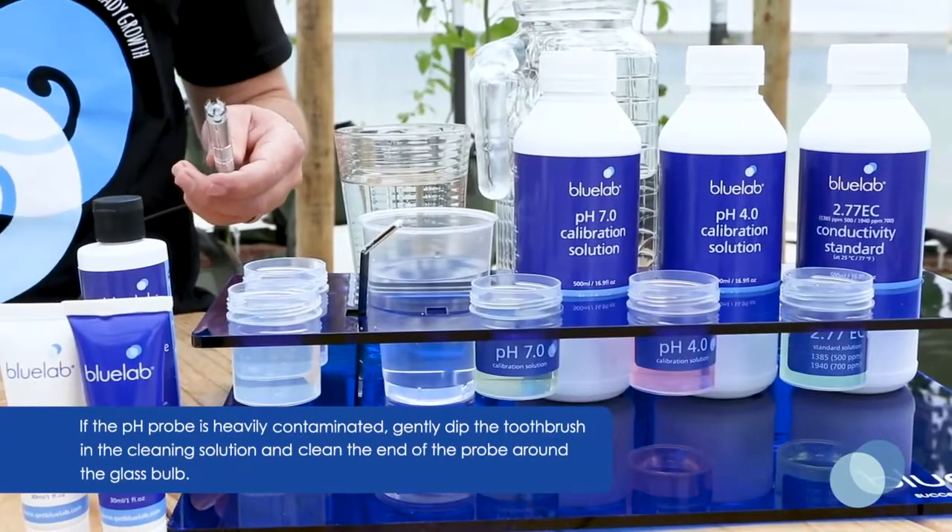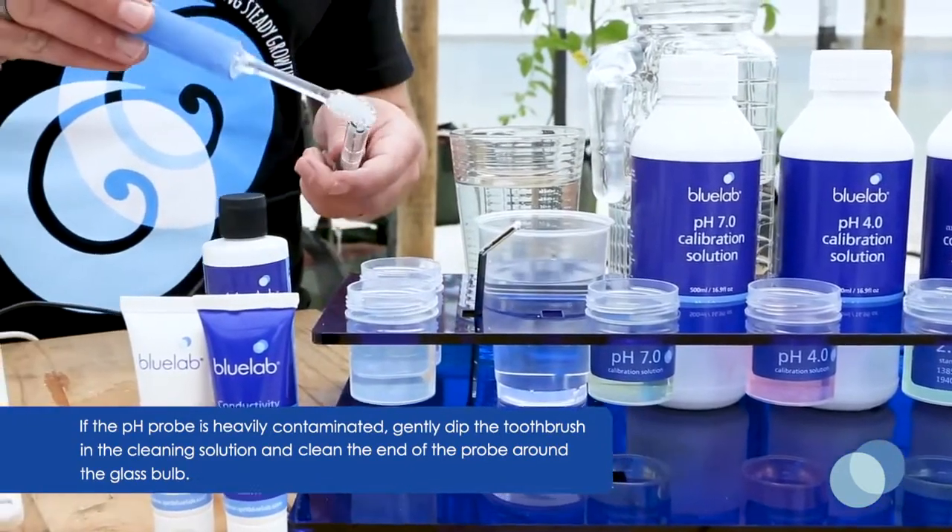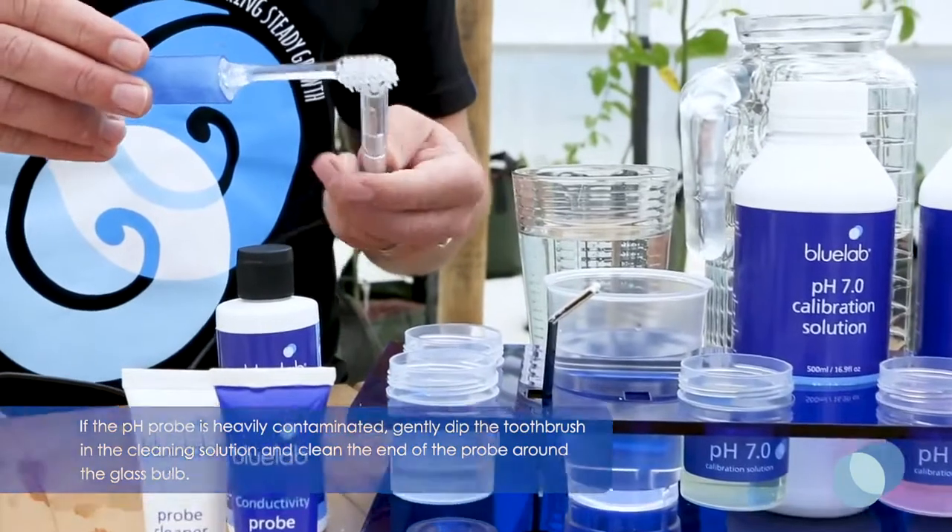If the probe is heavily contaminated, dip the soft bristled toothbrush in the cleaning solution and gently clean around the end of the probe on the glass tip.